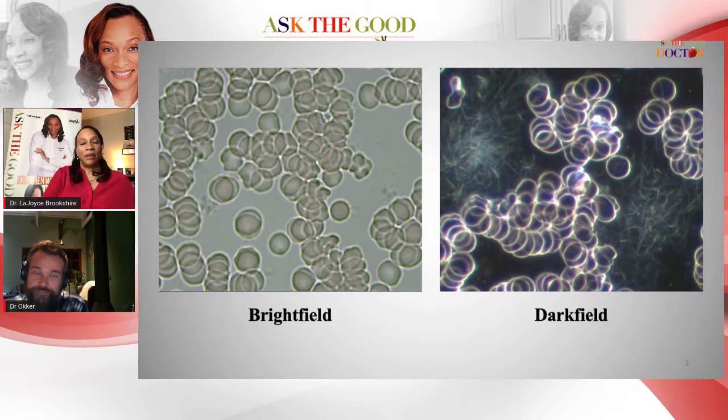And on the dark field microscope side, tell us about the cells of this person, this sample that you've presented here. All right, so if we look at the image on the right-hand side in dark field. Now, in live blood analysis, usually we start out by looking at a sample and comparing what we're seeing to what a normal picture would look like. Under normal conditions, the blood cells are arranged in a very specific way. So all those deviations from normal are really what's important in a live blood analysis session.